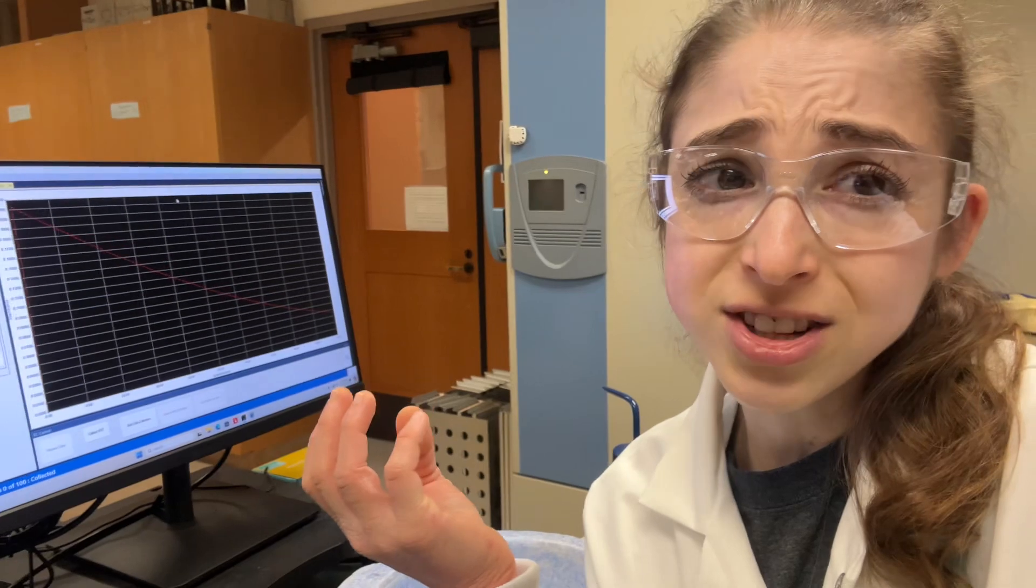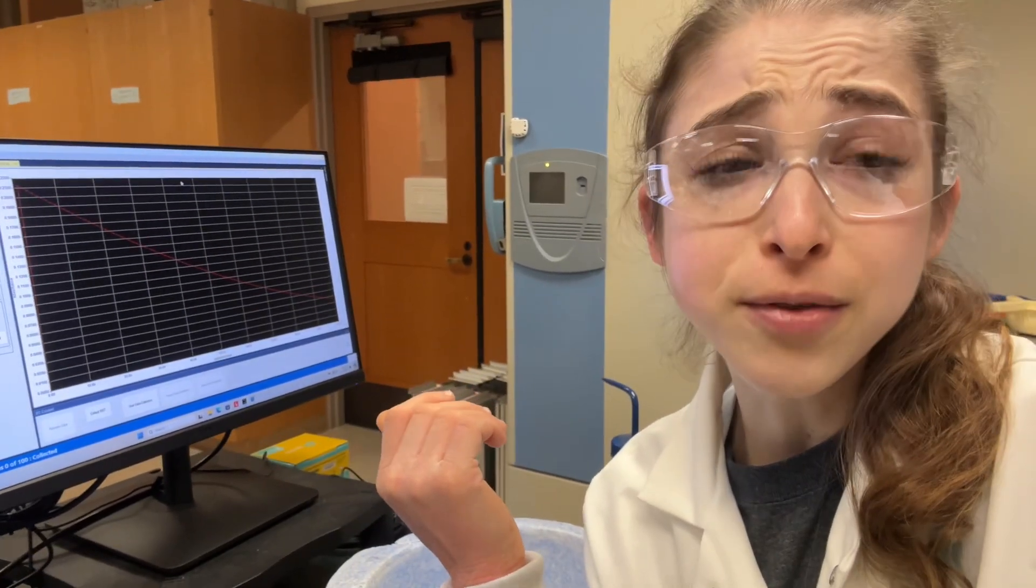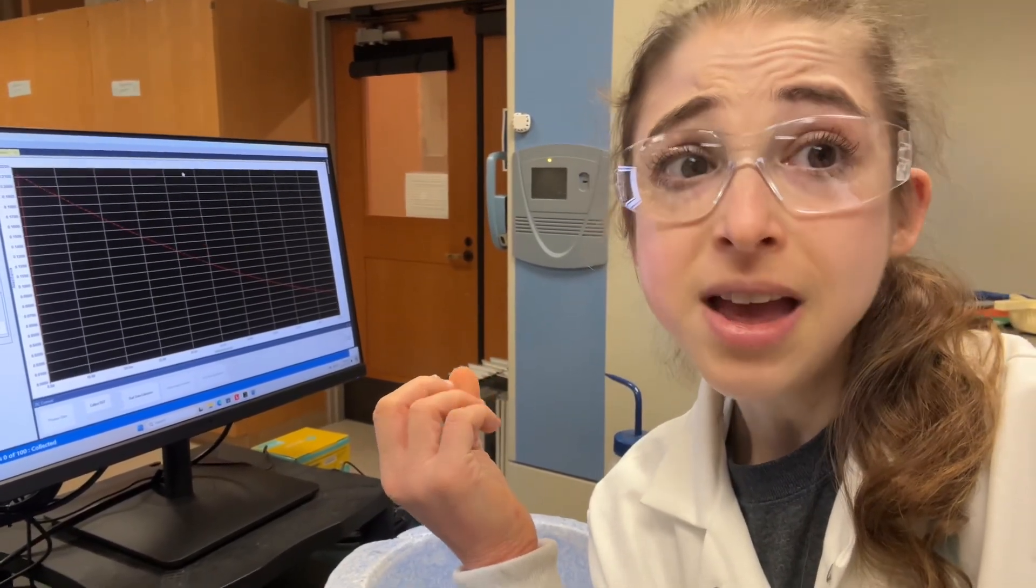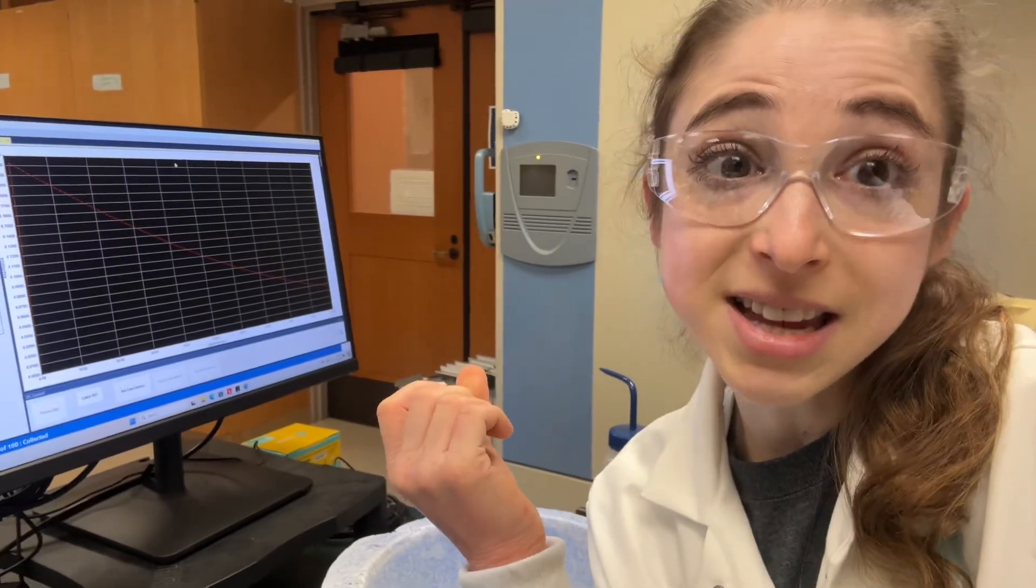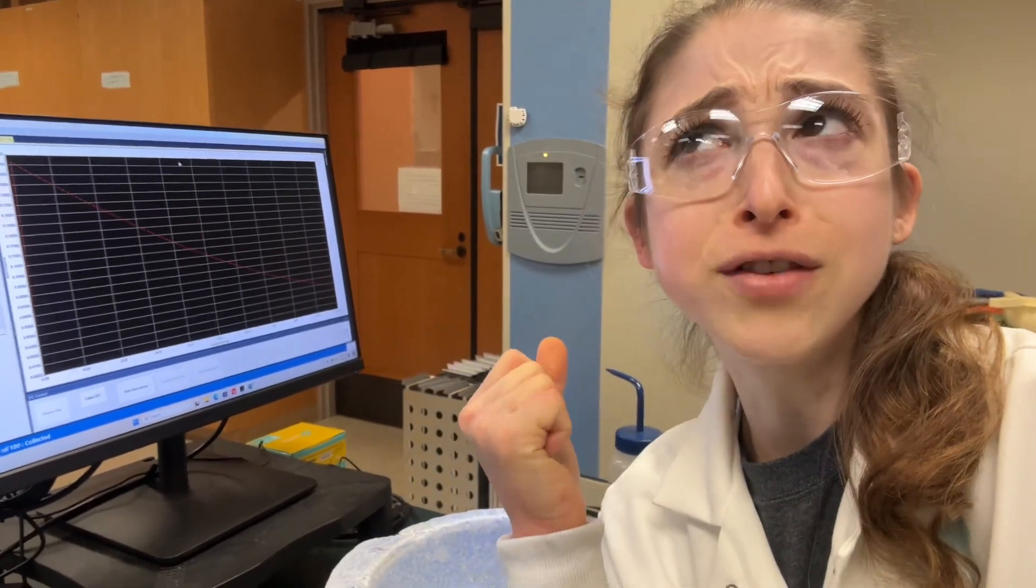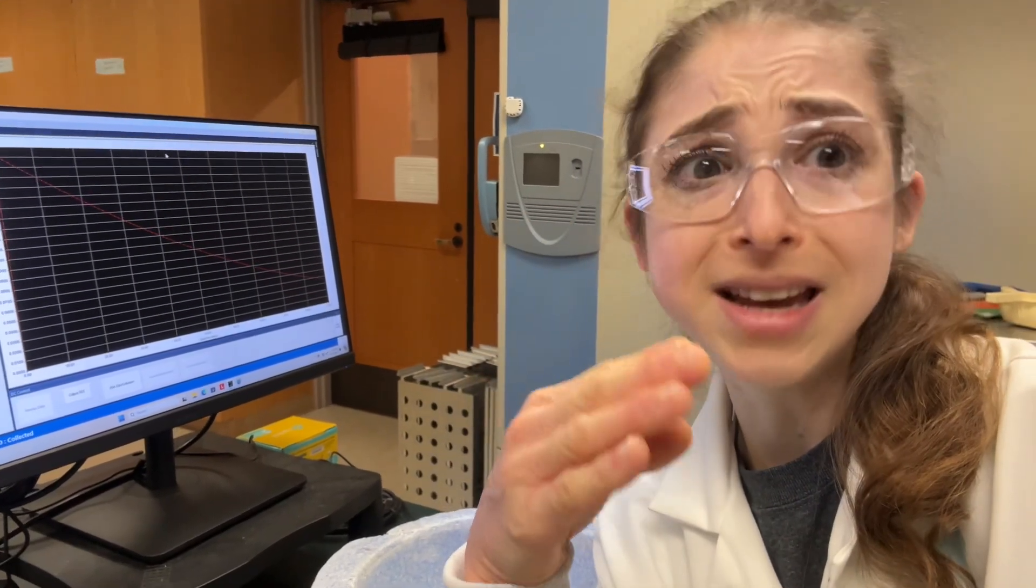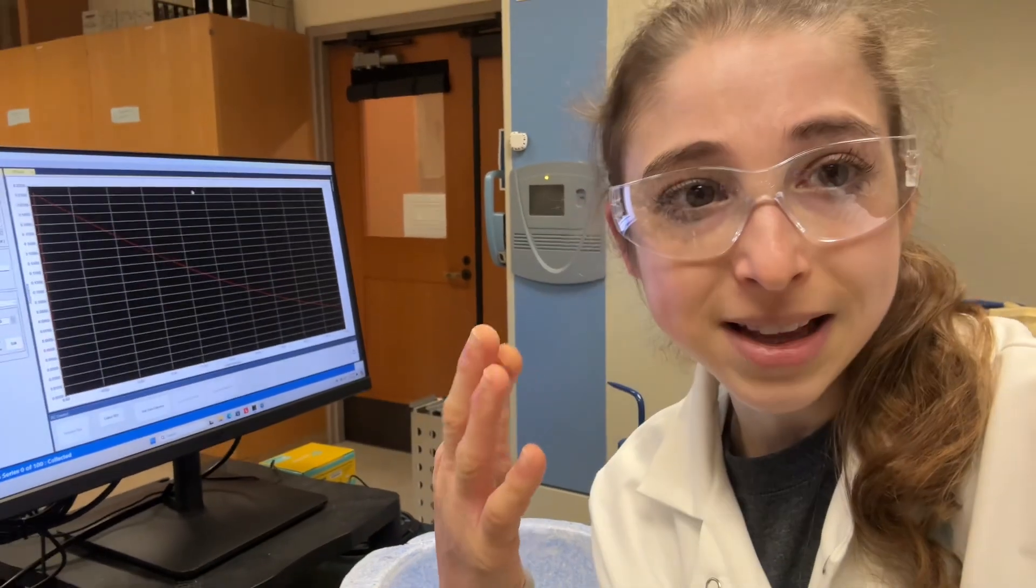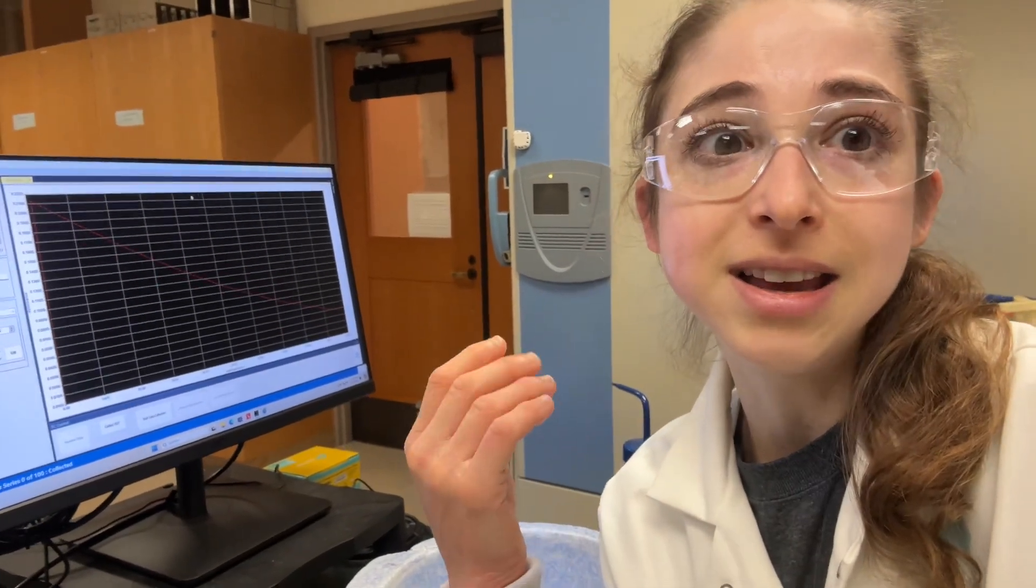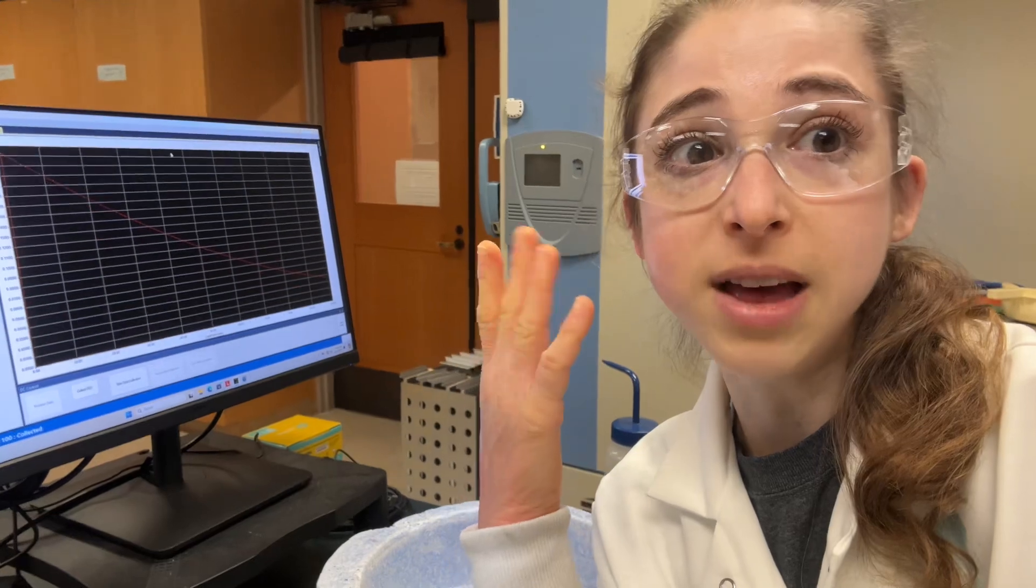In the case of malate dehydrogenase, we want to see, can it interconvert malate and oxaloacetate? Can it take oxaloacetate, take NADH, convert the oxaloacetate to malate, so reduce the malate, oxidizing the NADH, and then you get this reaction. Yes, I know it's the opposite way if you go in your TCA.